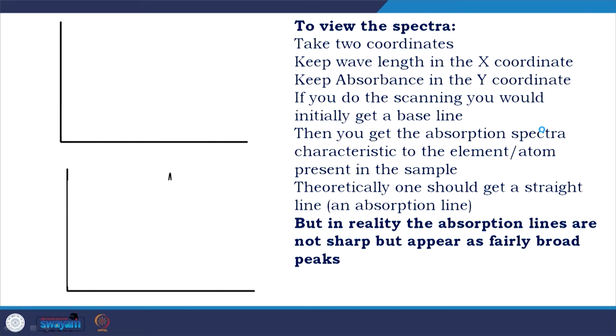So, to view the spectra, you have to take two coordinates. See here, I have taken two coordinates. I put wavelength on the x coordinate. I put absorbance on the y coordinate.